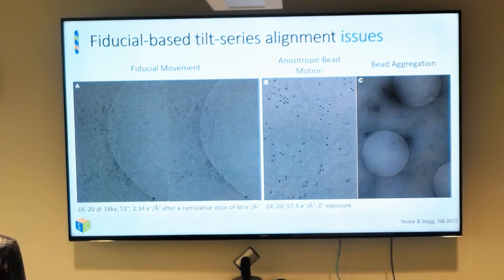Or is there any smart software that can just ignore them so that you could reprocess historical data? It's hard to ignore something that's in your power spectrum, because just cropping it out of the real space presents hard edges. I don't know of anybody who's done that, because there's really no motivation to do it. It's not simple.